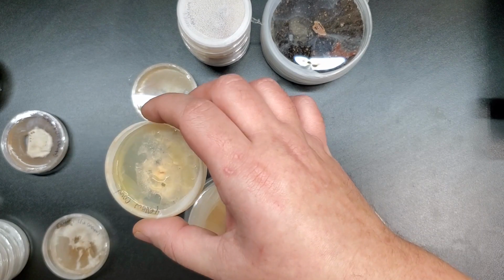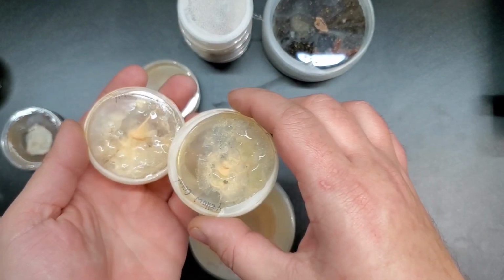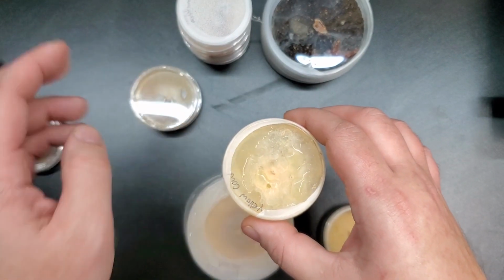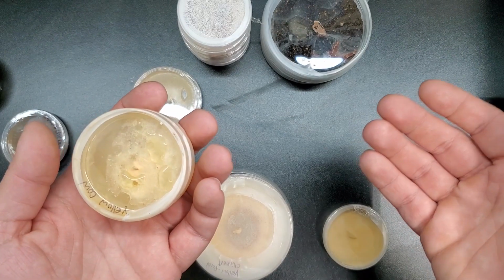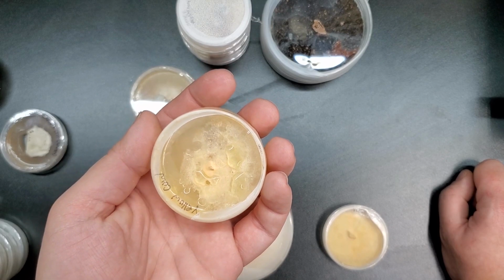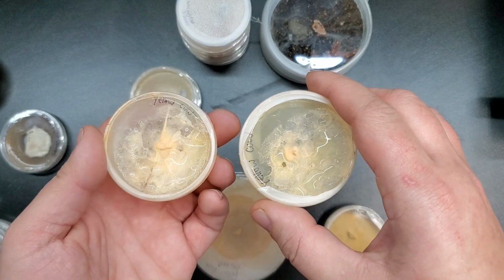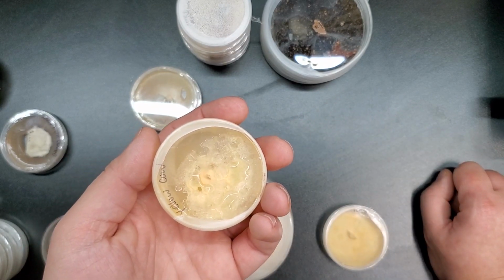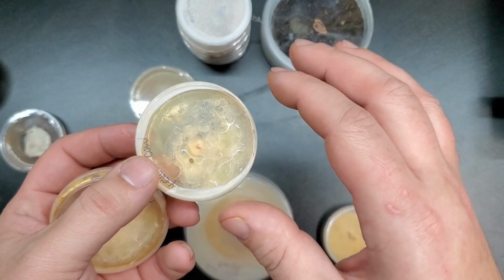These guys right here, you can see all the water in there. They're fully colonized. They look great as far as growth goes. But the problem with these two is I took a tissue sample from one of these, I'm pretty sure it was this one right here, and I placed it onto the agar. I placed these into my yogurt maker that I modified to turn into a mushroom incubator as well. And the problem that I had with that, which I had to fix after using it and finding out, was these were sitting directly on the bottom where the heating element was, and the parafilm did its job and kept the moisture in. But unfortunately, being that close to the heat and in direct contact with the heat source, it completely drove all of the moisture out of the agar itself and had it condense on the top of the culture plate here.